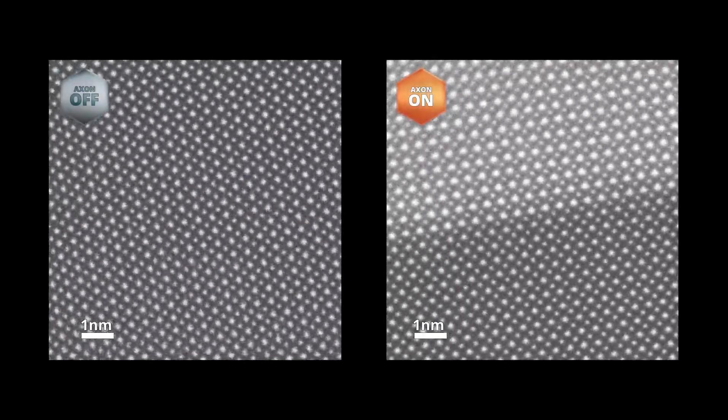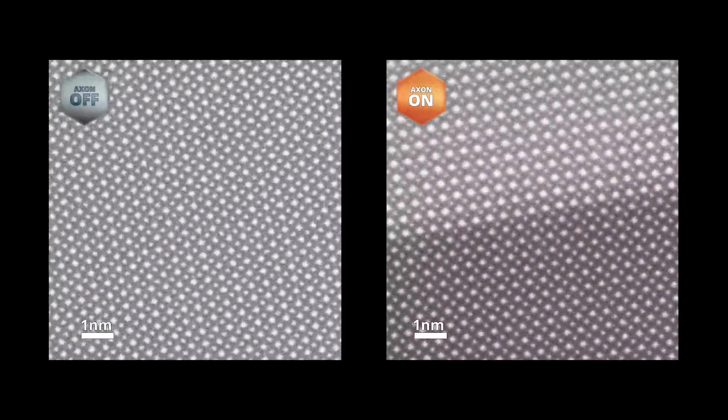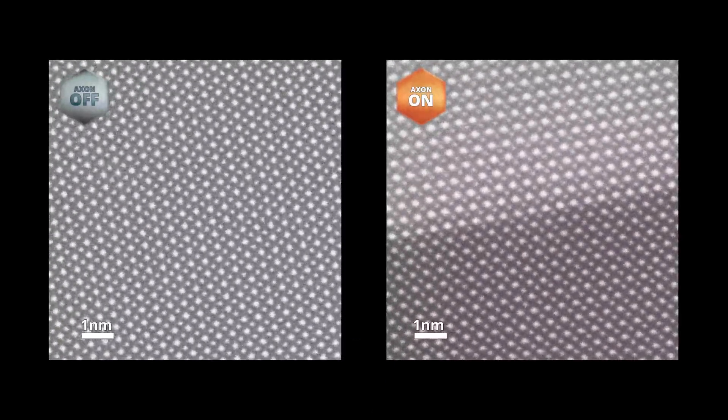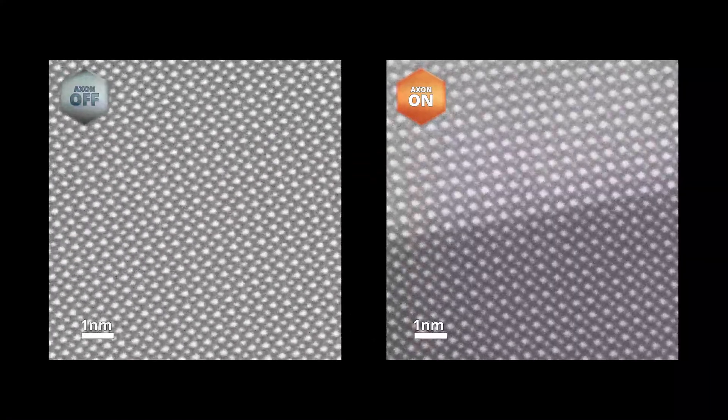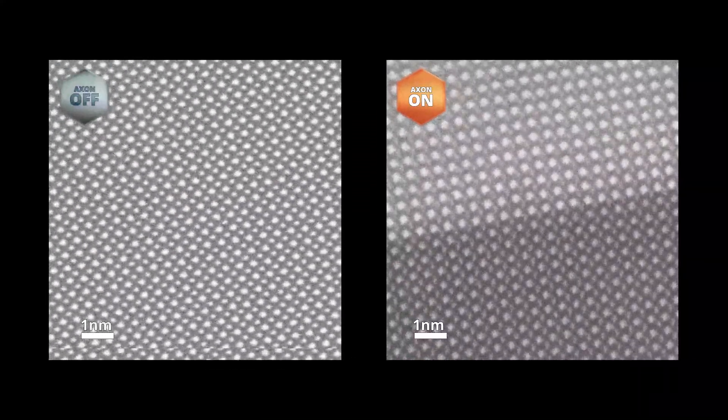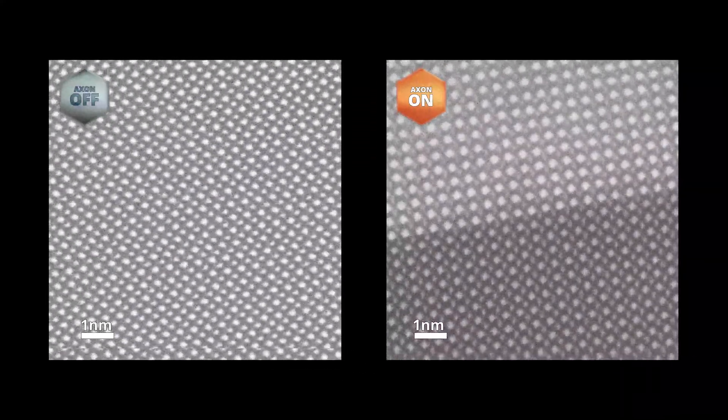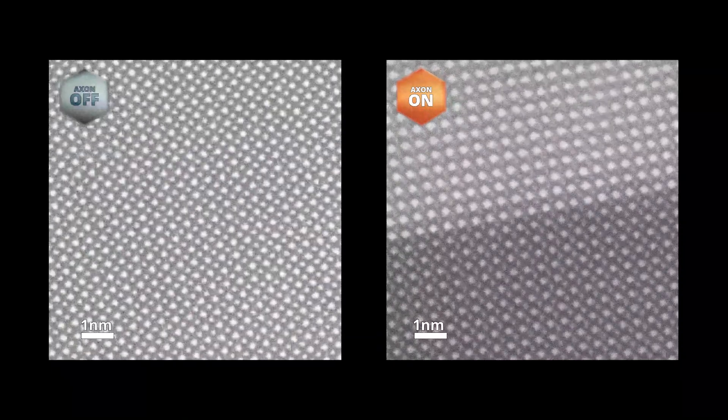This strontium titanate sample continues to drift for a long time even after tilting to the desired zone axis is complete. Axon helps you get right to work saving hours of time in the course of normal operations like these.